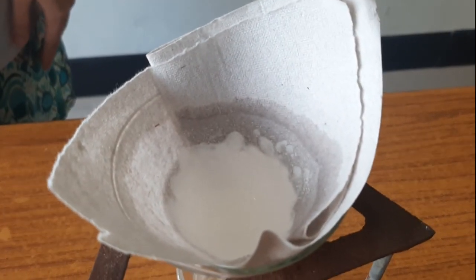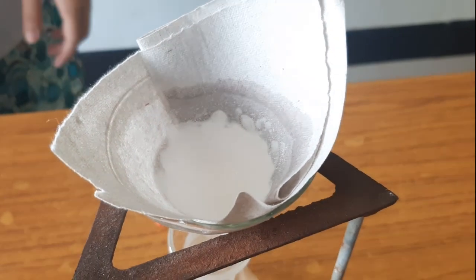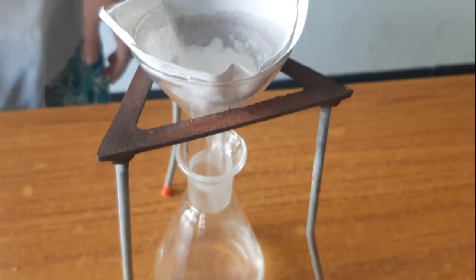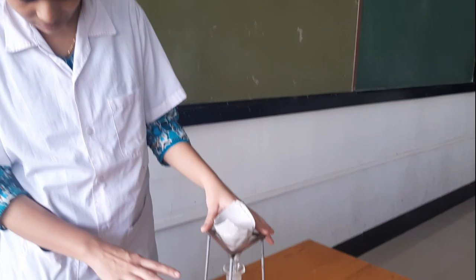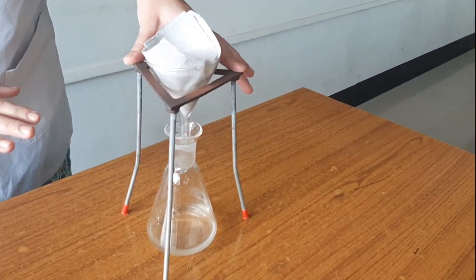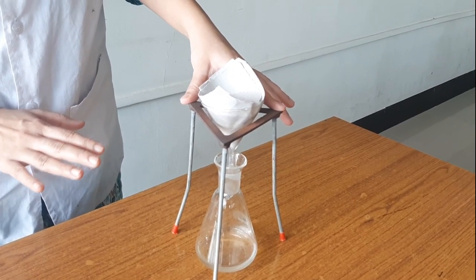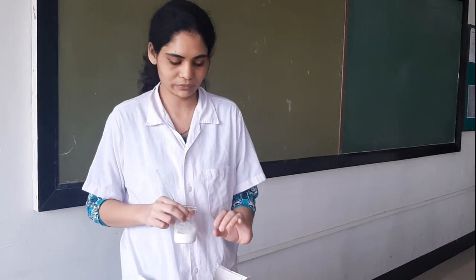Now, as you can see here, a very small amount of slurry is remaining. Now it will get filtered in just a small amount of time. Now, as you can see, we have obtained our last drop of the filtrate. It just fell, and the time required for this is 3 minutes and 4 seconds. Now we are moving to the next subsection of part B.